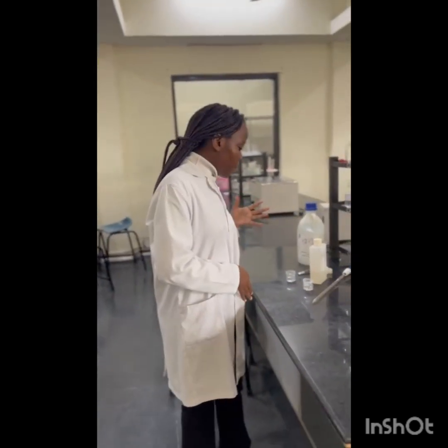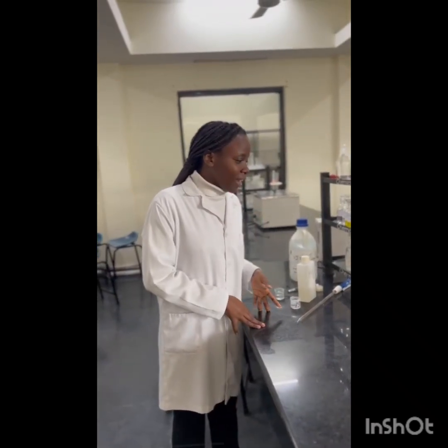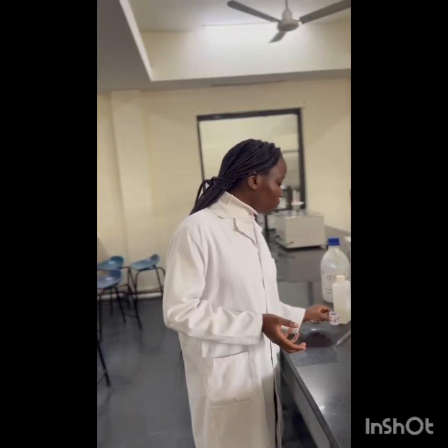While we wait for 7 days, I'm going to tell you about how we check the endpoint for decalcification. There are 3 methods. Since this is not a bony tissue, I'm not going to do endpoint testing because it doesn't have calcium in it. I will talk about the least used first.